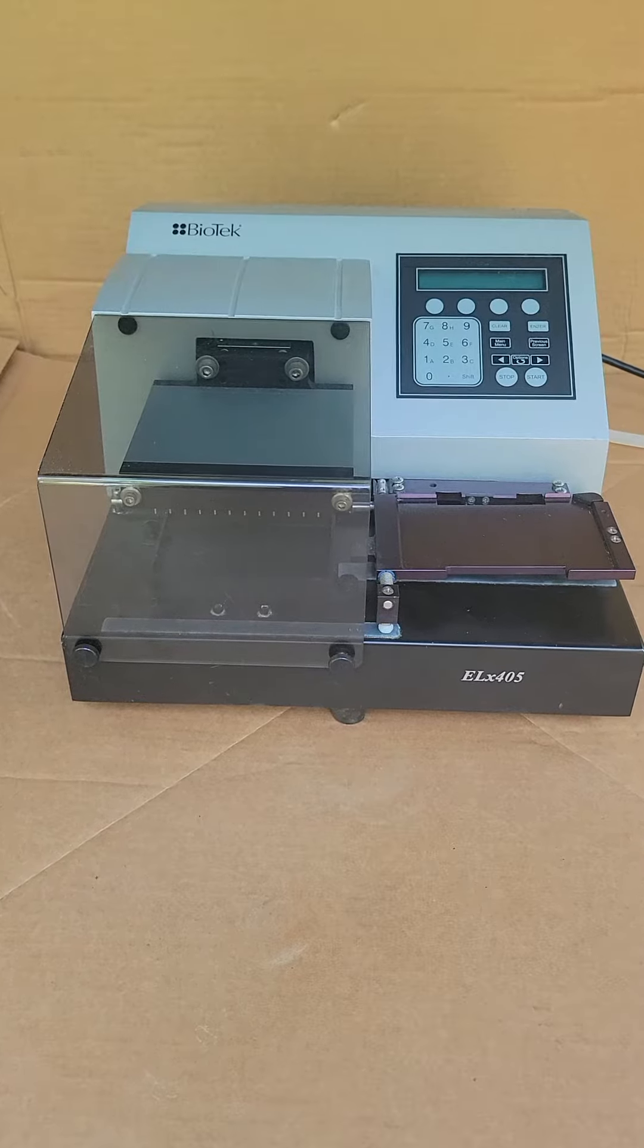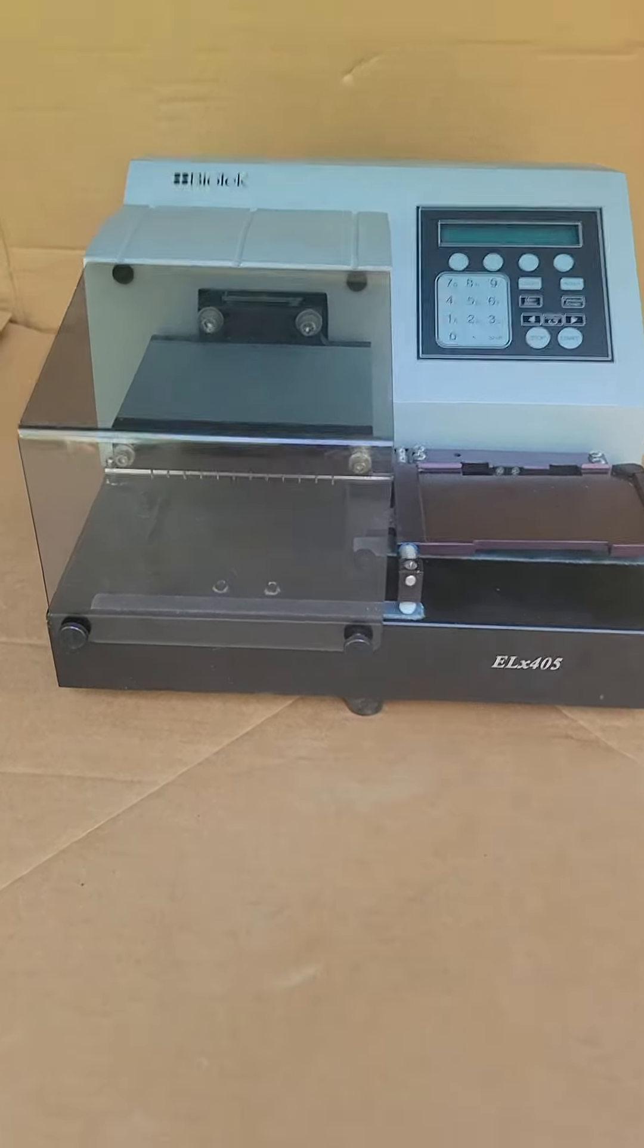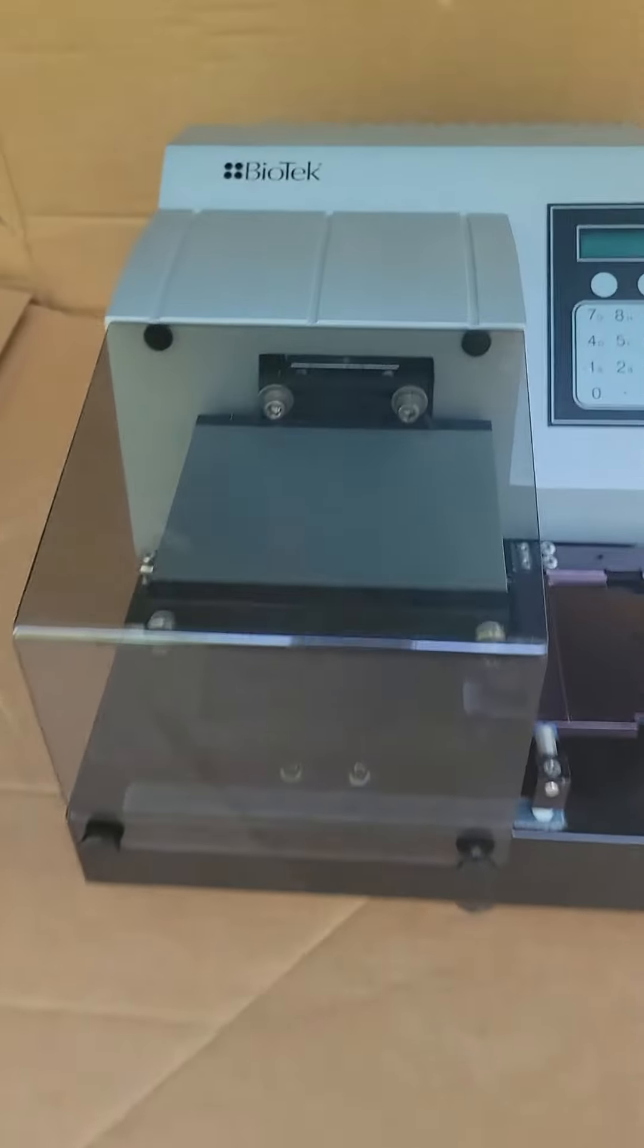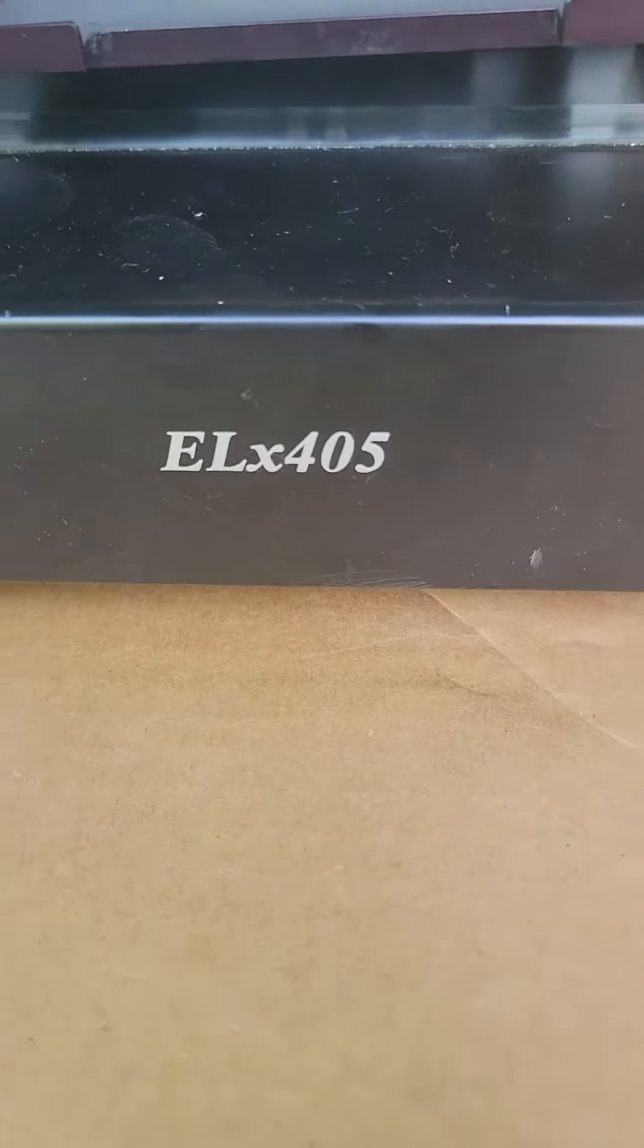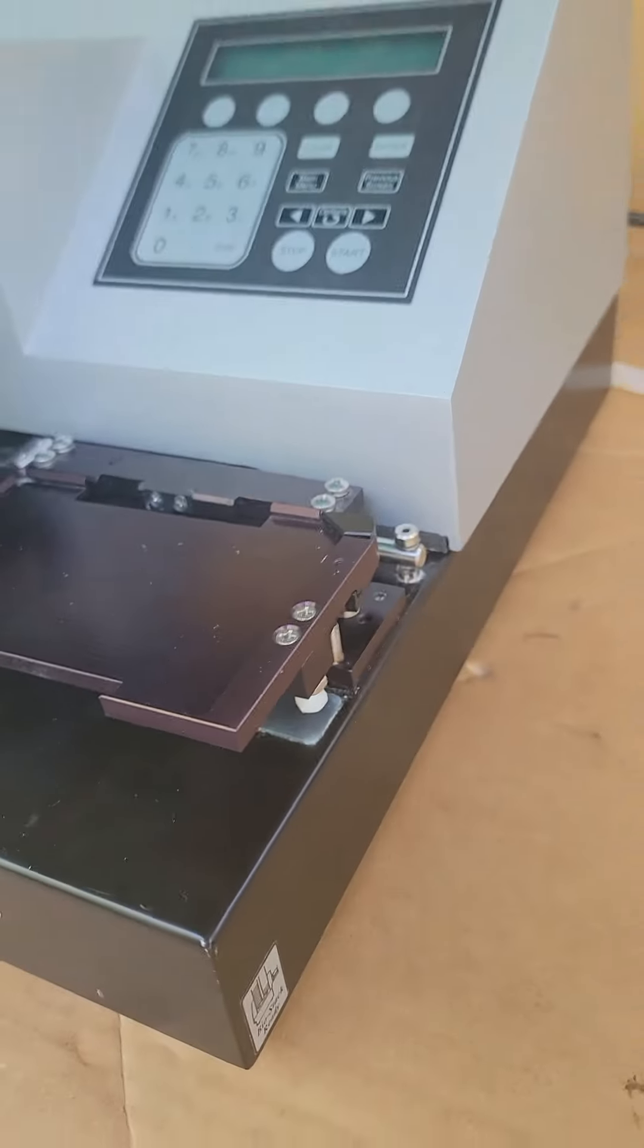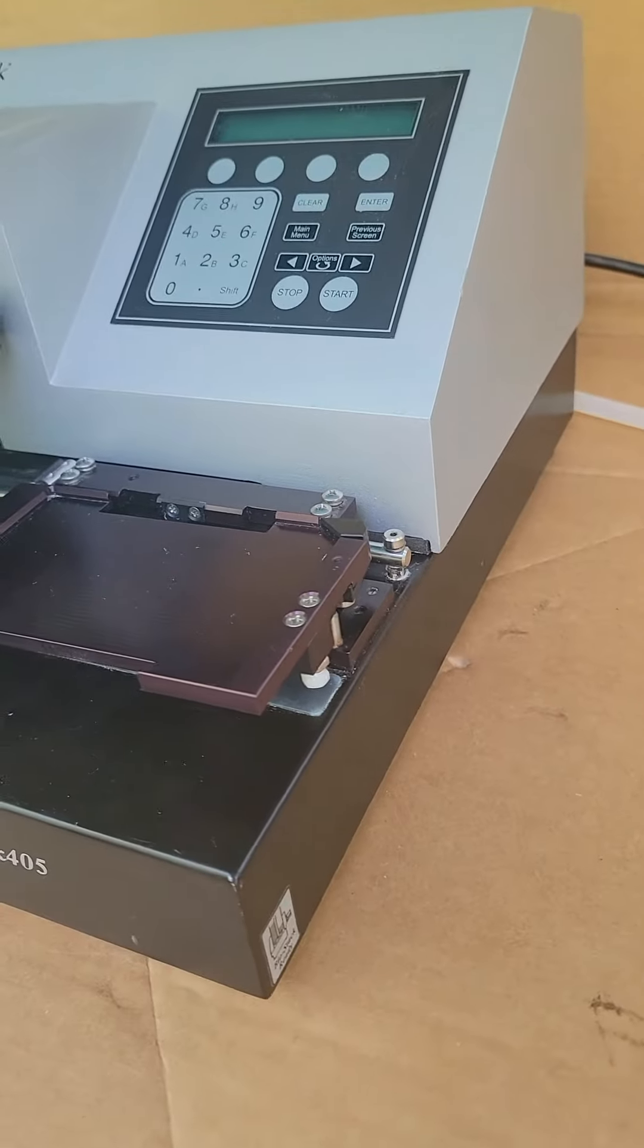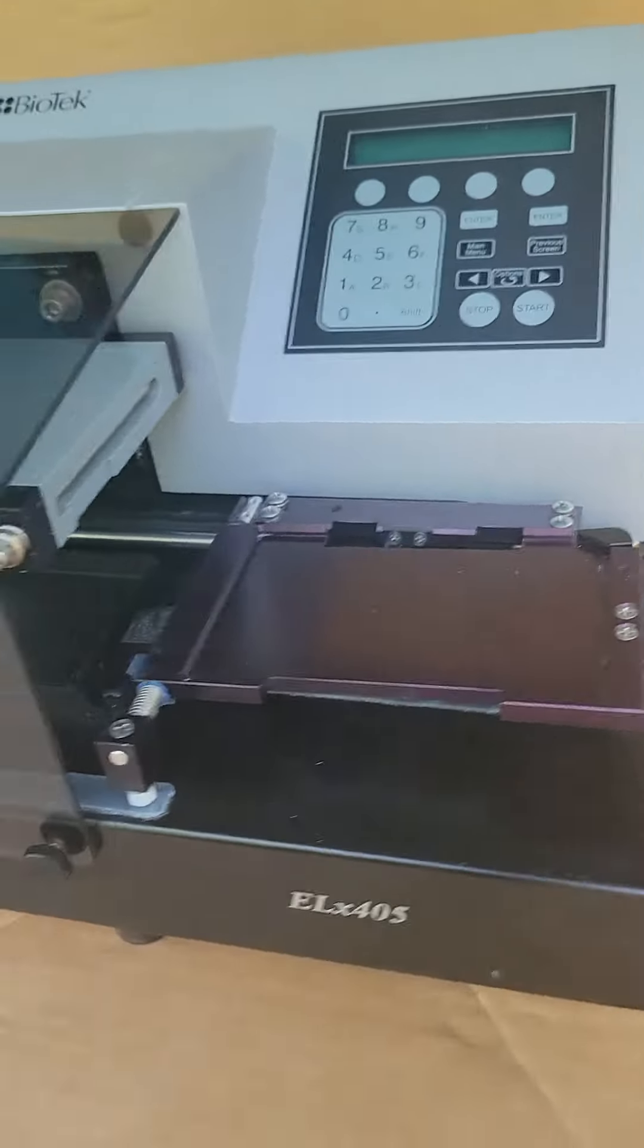So here we have a wonderful condition Biotek ELX 405. Looks real nice as well, as you can see.